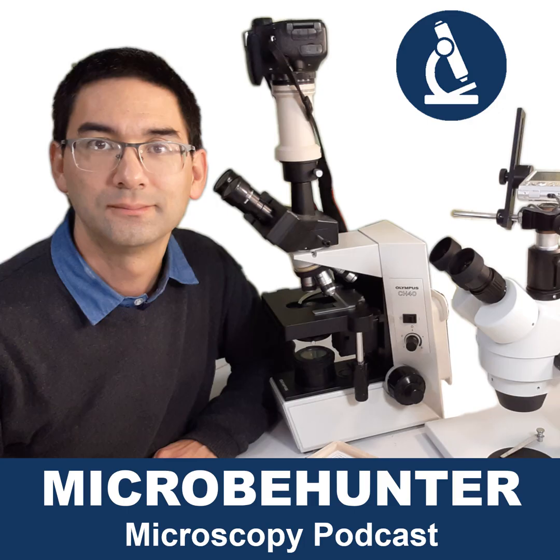On the other hand, if it's not phase contrast or DIC, then get yourself a simple bright field microscope with a decent condenser, a condenser that allows you also to attach a so-called dark field patch stop like this here, and then you'll also be fine. My advice is also, if you're serious about amateur microscopy, get one where you can take pictures, with a photo tube like they have here.